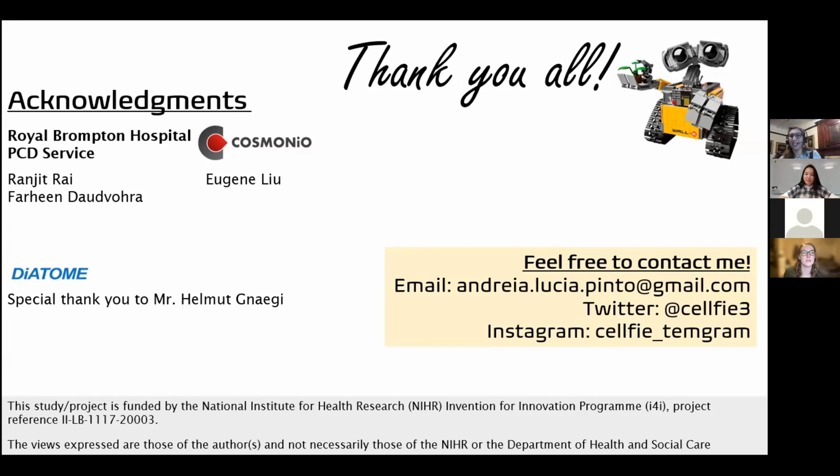Just a practical question. When you plan to roll this out to other centres, different machines for TEM, are they all able to collect the same resolution of images? That is such a good question, Katie, and I was hoping someone would put it. It's really important that we figure this out. I still can't answer you that. I know that we have 2 different microscopes in the lab today, and they give different images because one is equipped with a weaker camera, a low resolution camera, and we know that the images are not as good, but the system is still able to pick up.